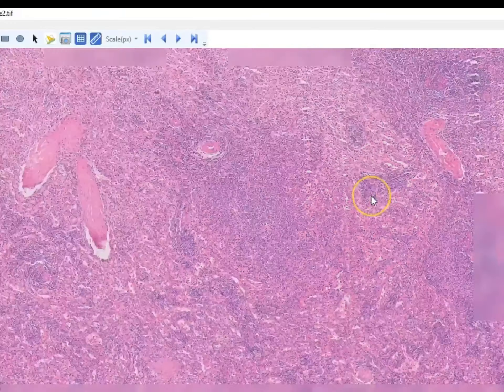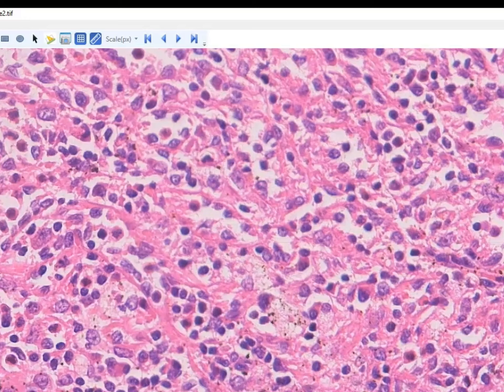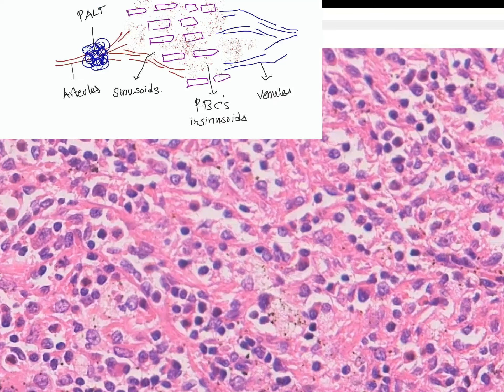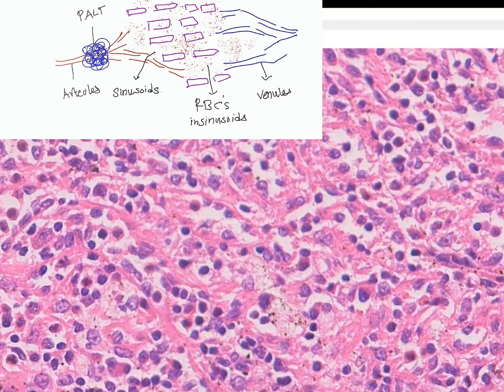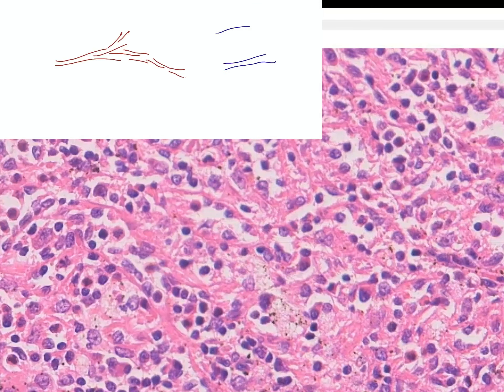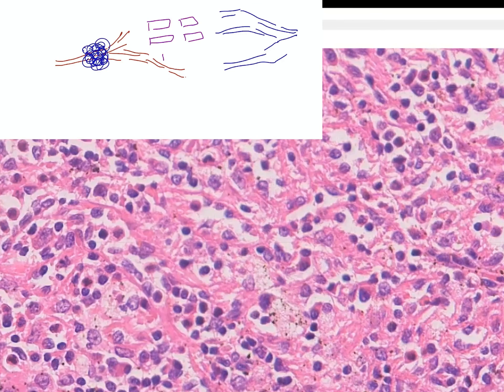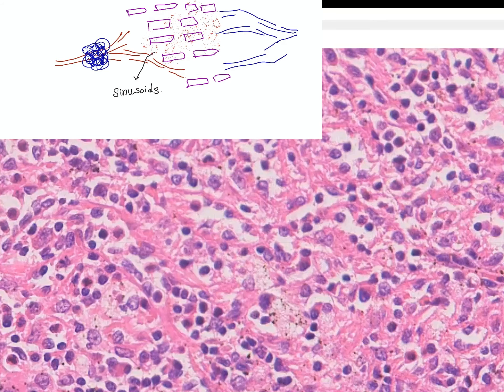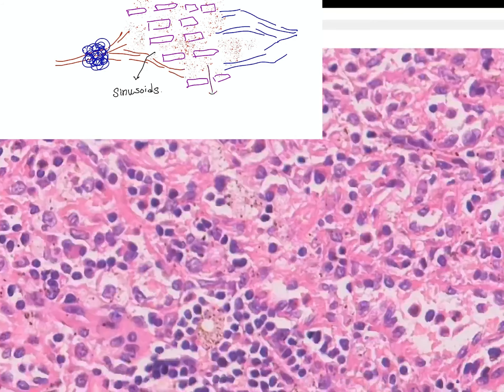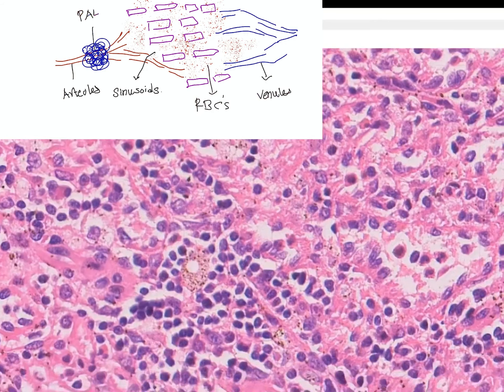Those are most probably small B lymphocytes, and after stimulation they may form the germinal center. There are also macrophages with hemosiderin, known as hemosiderin-laden macrophages, because as we all know that hemoglobin is broken down in the spleen.